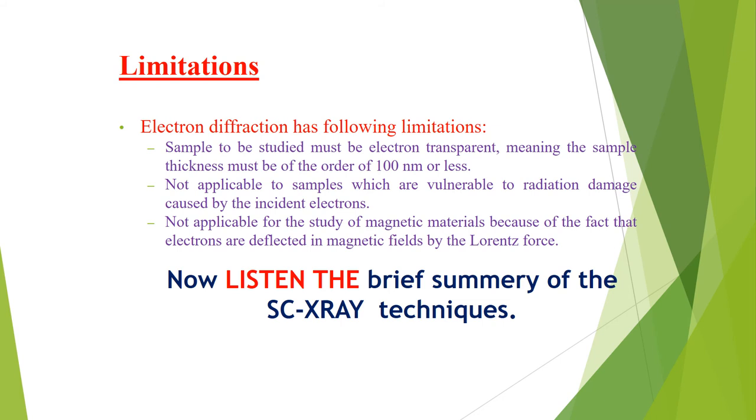In single crystal X-ray diffraction, X-ray diffraction includes two physical processes. Number one is scattering of X-rays by matter. Number two is interference of those scattered X-rays to produce a diffraction pattern. It is based on the principle that an ordered substrate yields an ordered diffraction pattern and a disordered substrate yields a disordered diffraction pattern. The result of single crystal X-ray diffraction is a highly ordered diffraction pattern, due to the substrate's highly ordered three-dimensional crystal structure, which makes the interpretation of the diffraction pattern more meaningful.